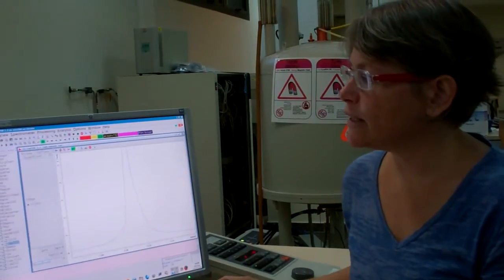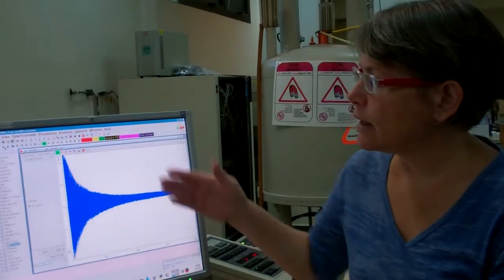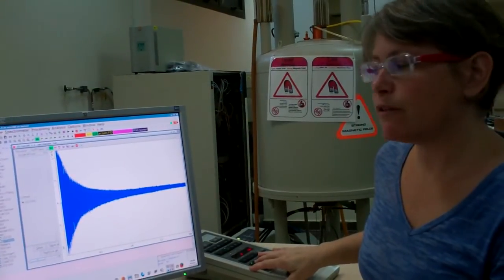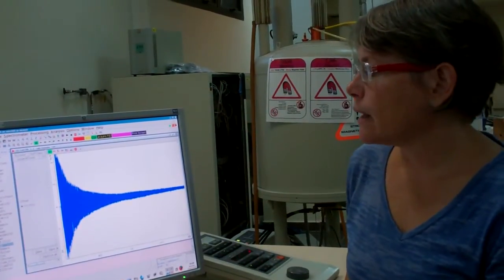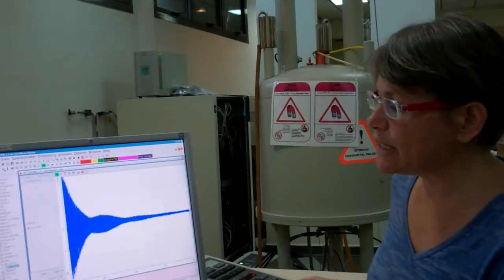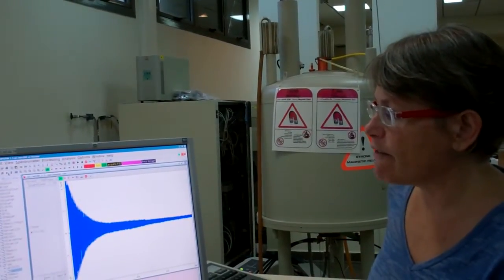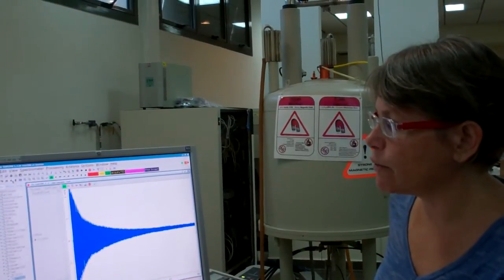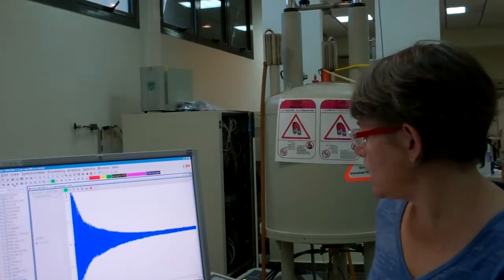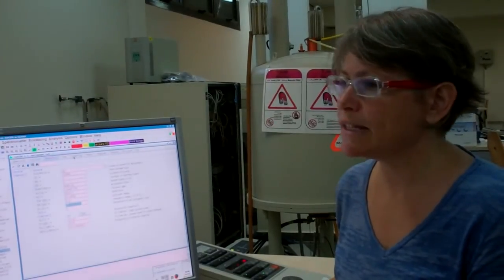Let's look back at our FID by toggling with this blue button, and we see the line shape is now much smoother in exponent. Let's undo that change to see the difference on the FID. This was our bad shim, and by changing the Z gradient on the shim, we can see the correction in real time as the FID starts to smooth out and look better. When I'm done, I press standby on the BSMS keypad and I press stop to exit GS mode.